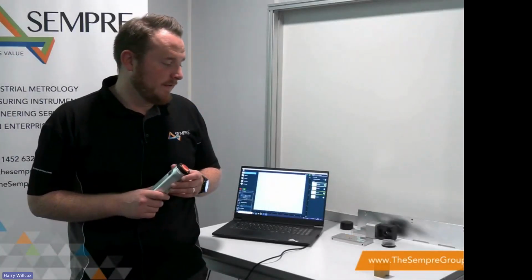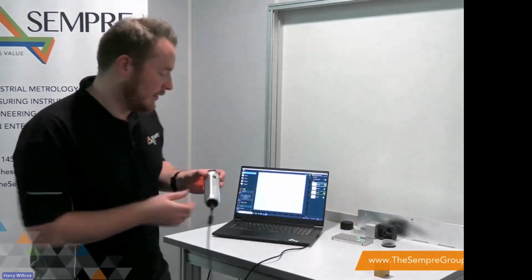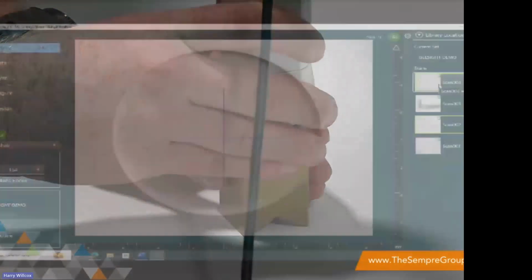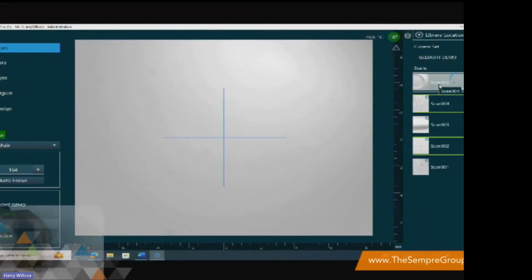We can use the Gelsight system for dimensional checks. In the example I'm going to run through here, we've got a hole diameter as well as the angle and the length of a chamfer. I'm going to bring the Gelsight system to the hole diameter to start with. I'm going to place it over and take a capture. I'm then also going to take a capture of the chamfer.